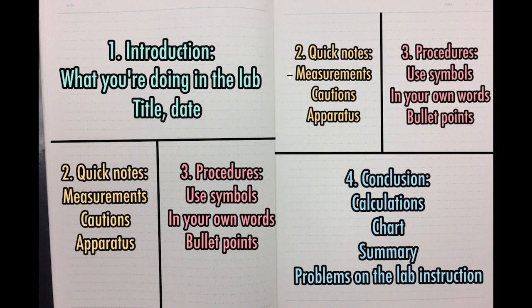In this video, we're going to show you how to keep a lab notebook. There are different ways to keep a lab notebook. However, all lab notebooks should have these four important parts. Number 1, introduction. Number 2, quick notes. Number 3, procedure. Number 4, calculations and conclusion.